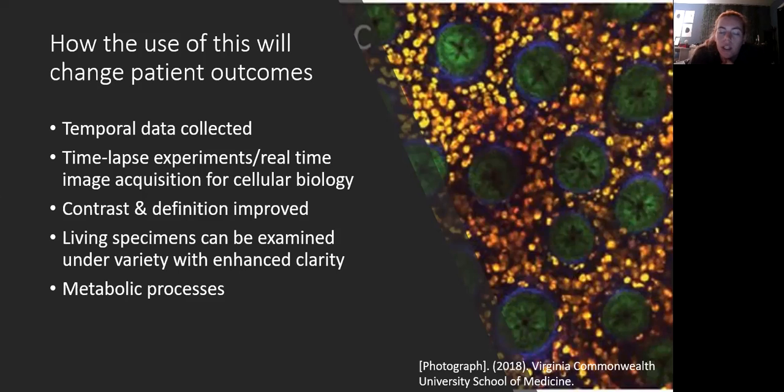These time-lapse experiments and real-time image acquisition for cellular biology are very important information for the doctor, so always appreciated. The contrast and definition is very greatly improved due to the addition of the confocal, and living specimens can be examined with such good clarity.